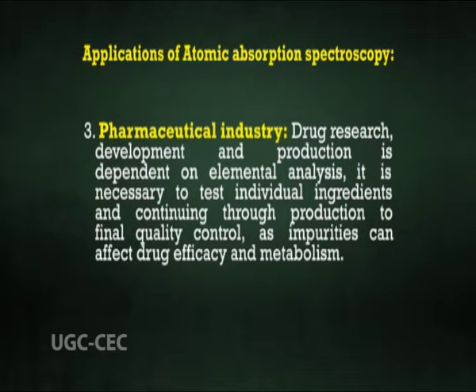Number 3, pharmaceutical industry. Drug research, development and production is dependent on elemental analysis. It is necessary to test individual ingredients and continue through production to final quality control, as impurities can affect drug efficacy and metabolism.